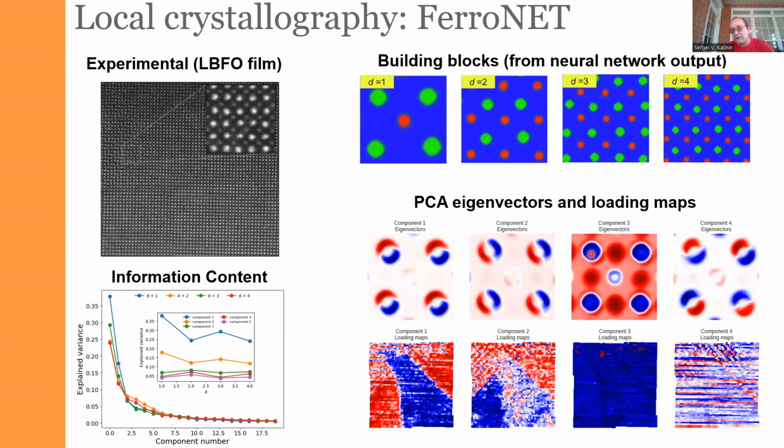And it's also the relative change of the intensity of the A cations. So first we thought that this is noise, because we thought that there are only these outliers here. But it turns out that if you look more carefully, you can see that the domain walls are actually darker. So there is some physical mechanism here that we don't quite understand, but PCA reveals it.